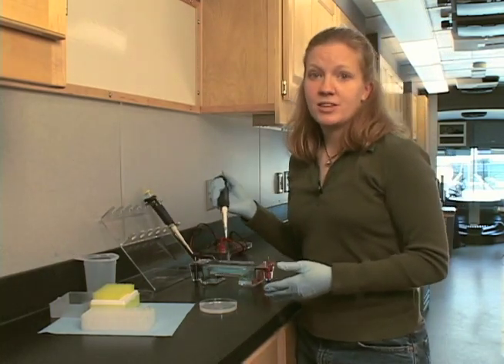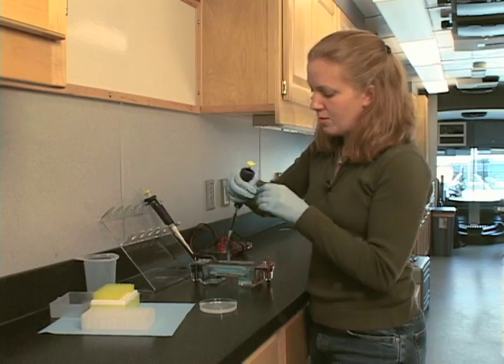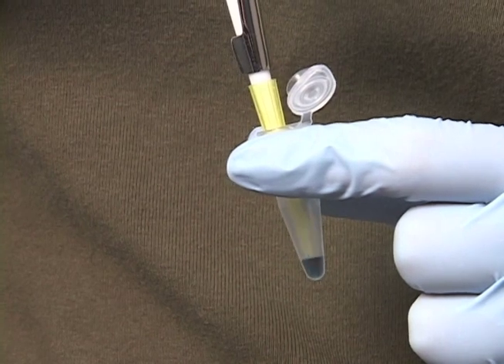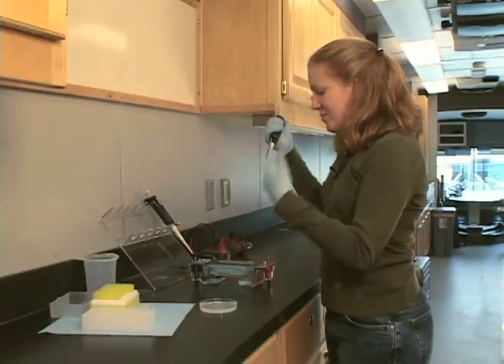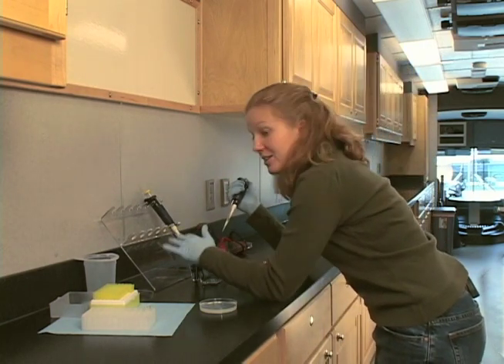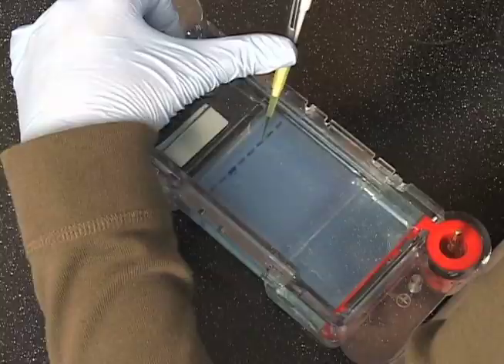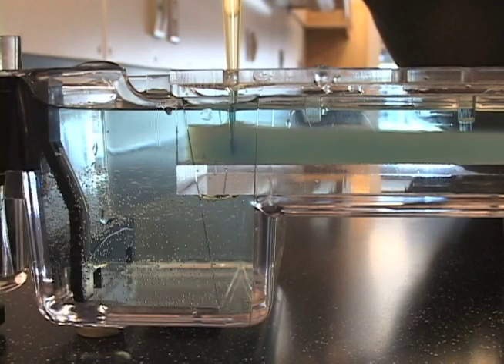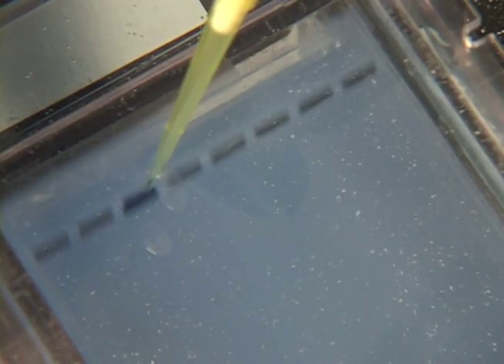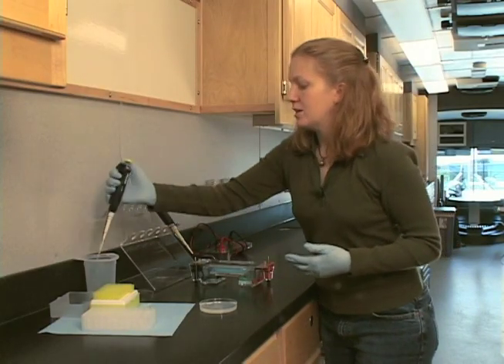Now that we've practiced on the pipetting station, we'll go ahead and load a sample onto the gel. Go ahead and get another tip. I'm going to go ahead and mix my sample again. I've drawn up my sample volume, and now I'm going to load it onto this gel. This is a little easier for me than the pipetting station to steady my hand, because you can actually just put your hand on the back end of the gel box. Position the tip over the top of the well, get it down into the well but below the buffer. Push your thumb down to release the sample, and don't pull your thumb up until you've pulled the tip out of the buffer, so that you leave the sample in the well. Go ahead and eject your tip.